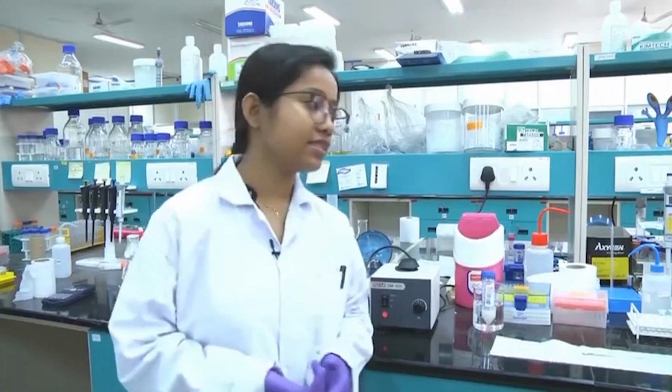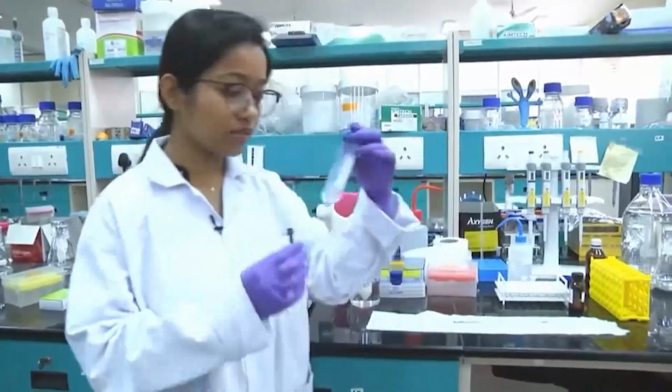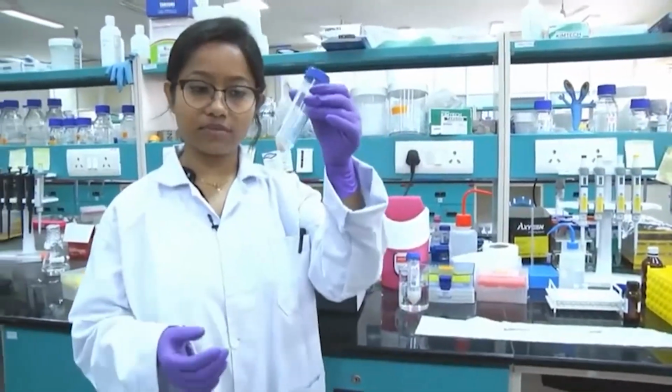So we have grown our cells in bacteria, and after the induction process we need to collect the cell pellet. We do a centrifugation process to get the cell pellet, and the media, which comes as the supernatant, we throw away. When you collect the cell pellet, it will look something like this.